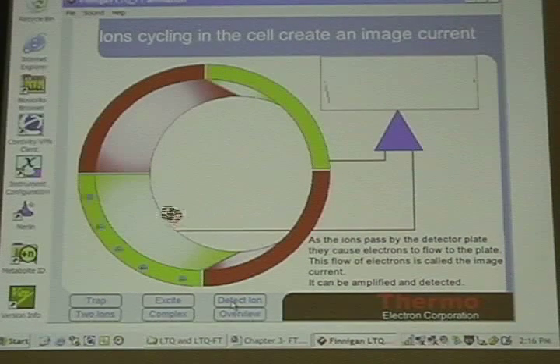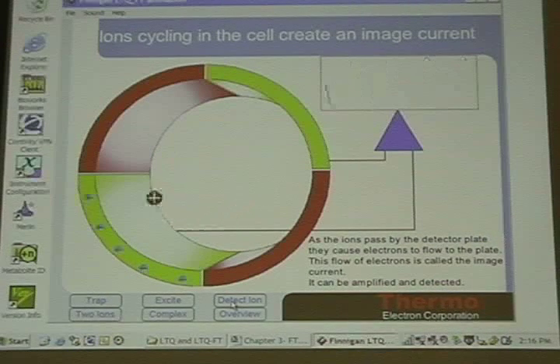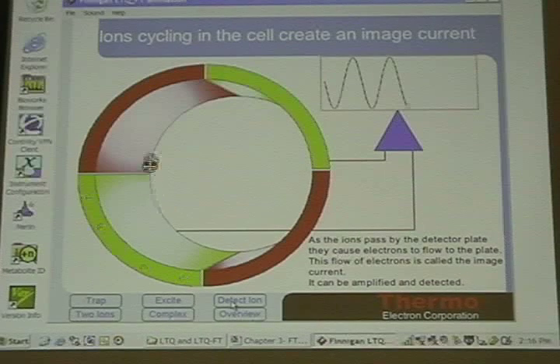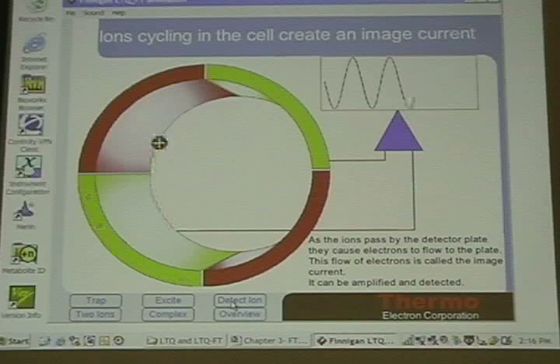With the FT, it is not uncommon to drag across the peak and see a ton of data points, and then drag where there was no significant peak and not see even small grass. You'll see nothing, because we've dumped out the data completely. It's gone to 0. This is how we take a 2 gigabyte file for one spectrum down to 37 kilobytes per spectrum. So why is it not an alternative just to take that full data and centroid it? Obviously centroiding would drop it down.